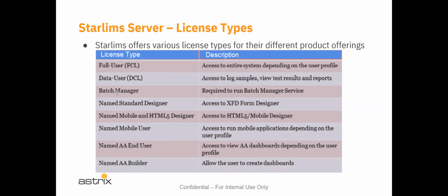There are 2 types of licenses associated with designers. For the V11 systems, the XFD form designer is required in order to access that older technology. However, they have a newer license called the HTML5 Designer, which not only allows access to the XFD, but also allows access to the HTML5 components and forms. And these are separate licenses that are purchased separately.